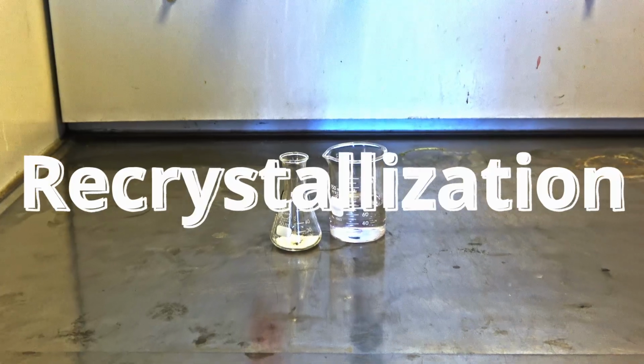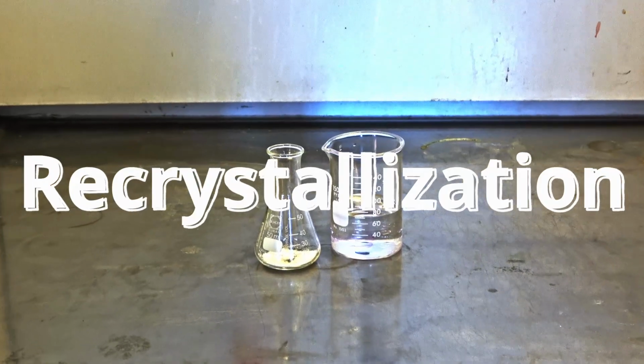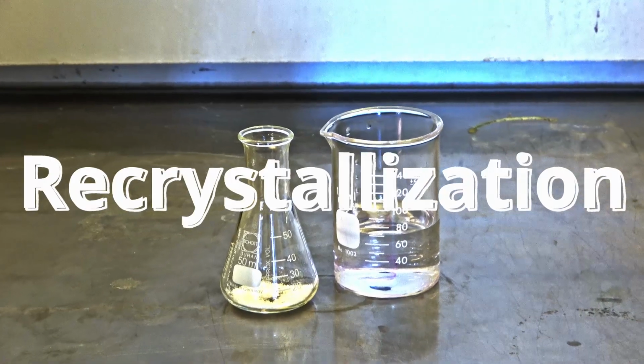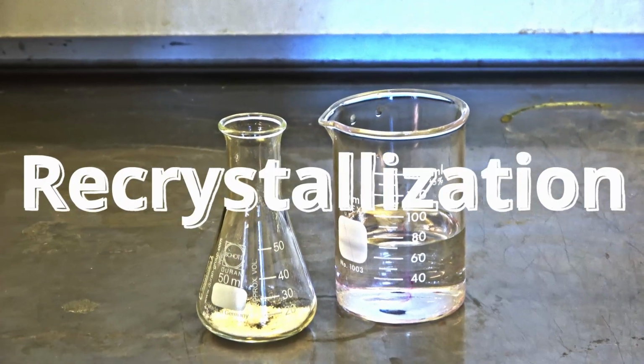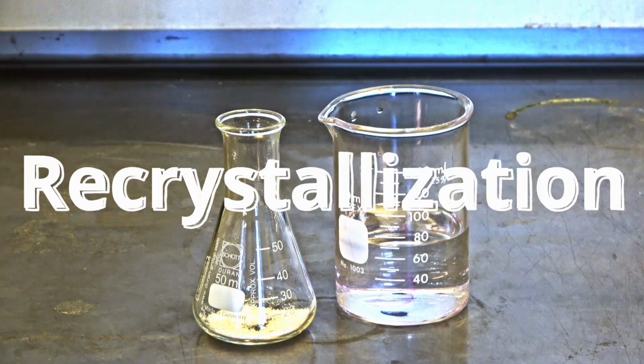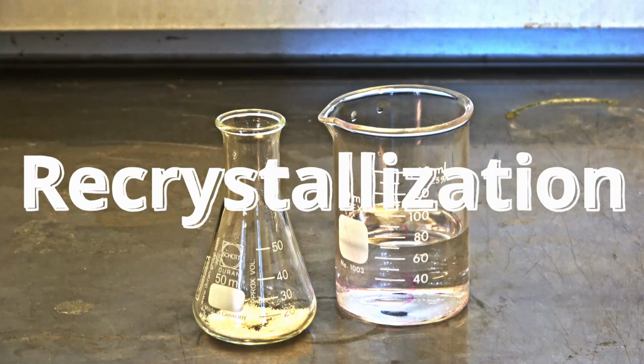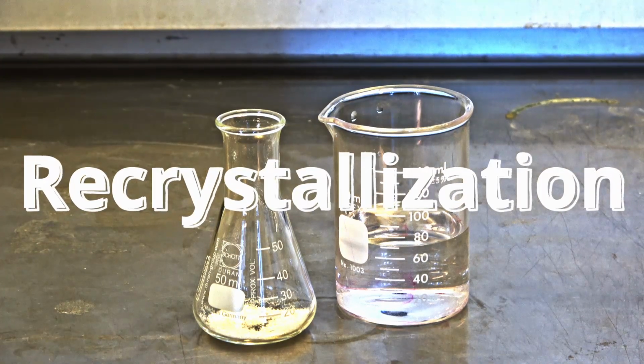Recrystallization is a laboratory technique used to purify solid compounds. It is often used after chemical synthesis to remove impurities from crude products. Recrystallization is based on the principle that solid compounds tend to be more soluble in hot liquids than in cold liquids.